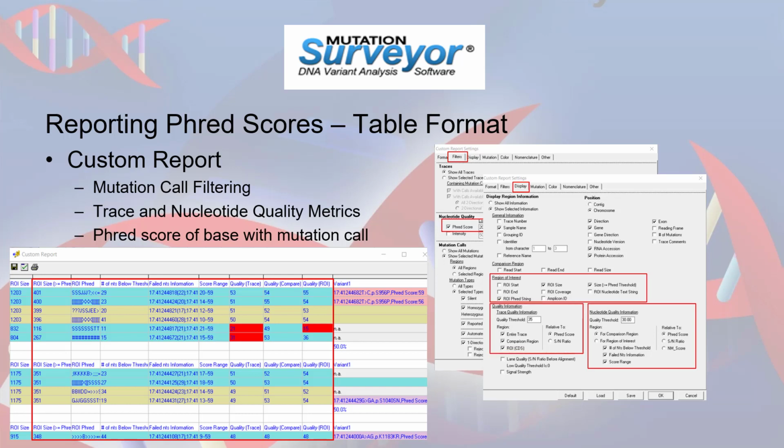The Quality Information section also includes options to display nucleotide quality information for the sample trace files included in the report. After setting your desired Phred score threshold, you can report trace sample metrics based on this value, including the number of nucleotides in the sample with quality values below this threshold, the location of these nucleotides, and a range of Phred scores in the sample.